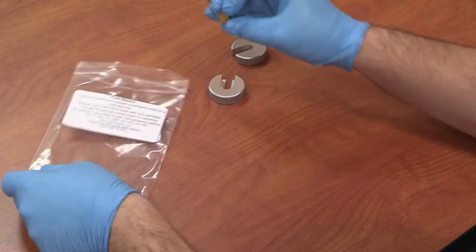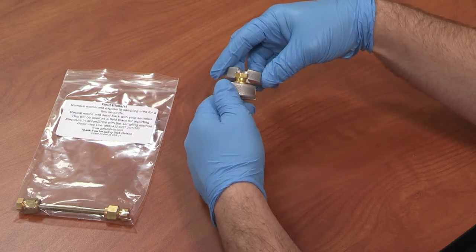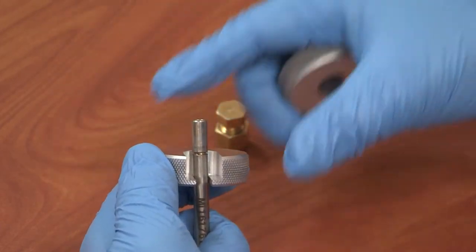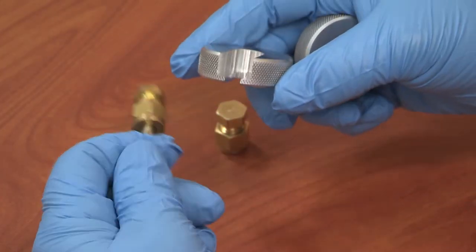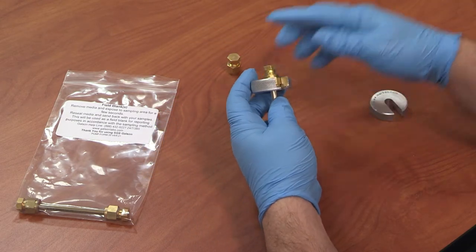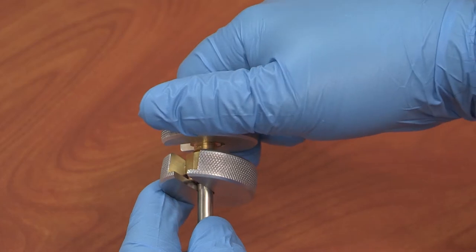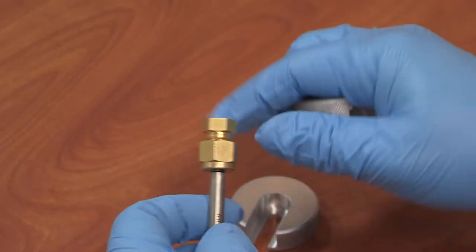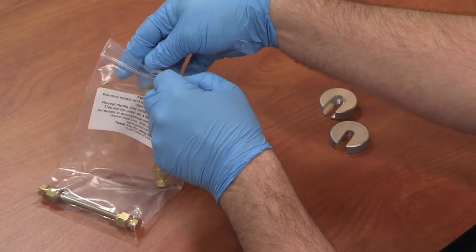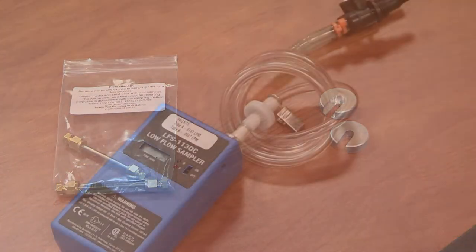Once you have entered your monitoring site, begin your sampling event by removing the field blank tubes from their packaging. While wearing the provided gloves, remove the Swagelok end caps with the included wrench set. Immediately recap the field blanks with the Swagelok ends, using the provided wrenches to ensure they are tight. Be sure to only use the wrenches from the kit — using your own wrenches could damage your sample.